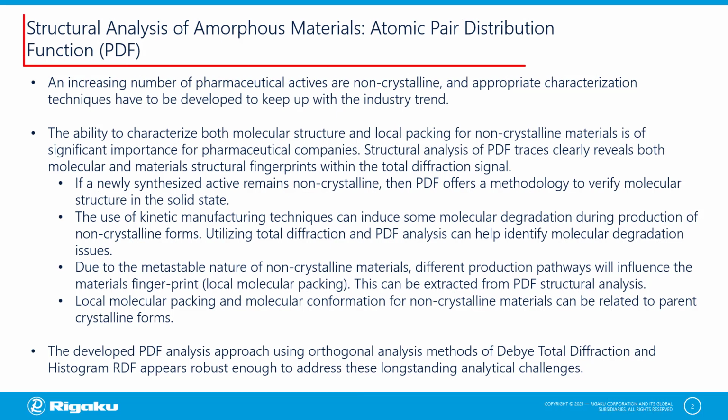So why perform structural analysis of amorphous materials, and why use atomic pair distribution functions, or PDF, to perform this analysis? It turns out that an increasing number of pharmaceutical actives are non-crystalline in nature, and appropriate characterization techniques have to be developed to keep up with this industry trend. The ability to characterize both molecular structure and local packing for non-crystalline materials is of significant importance for pharmaceutical companies.